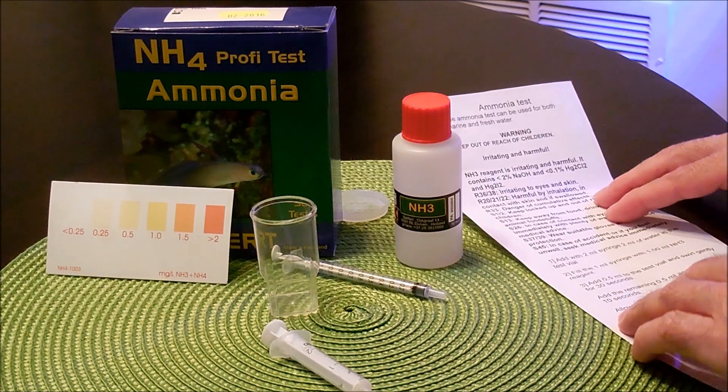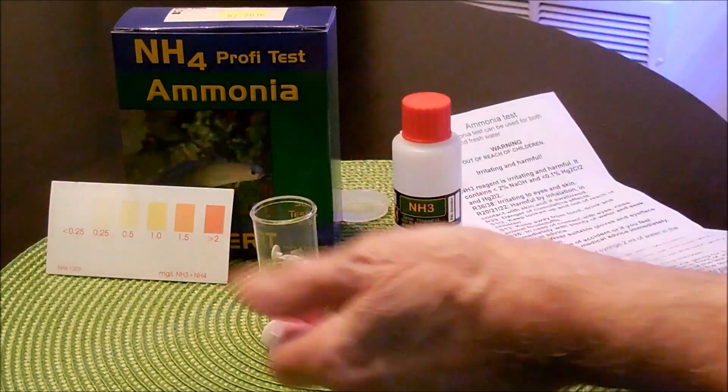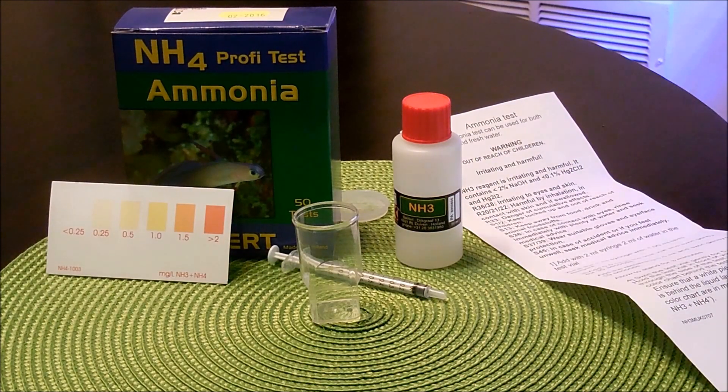The first instruction says add 2 mL with a 2 mL syringe — add 2 mL of water into the test vial, which is just here. So let's go ahead and get some water. Ok, here's 2 mL.